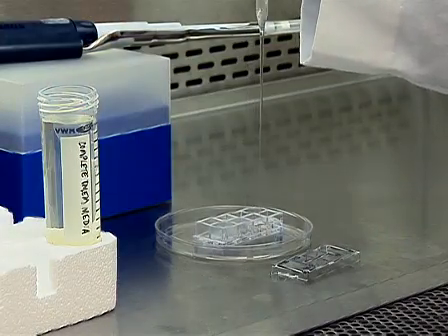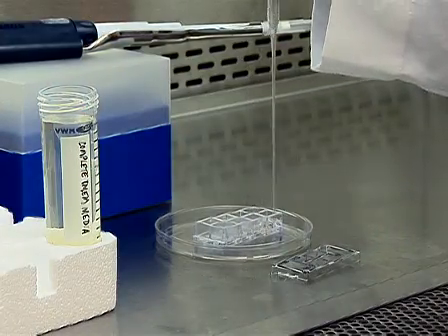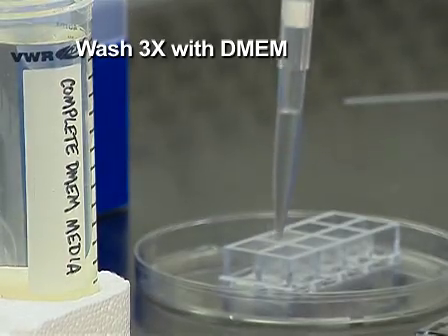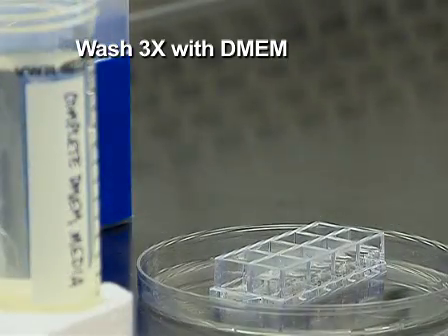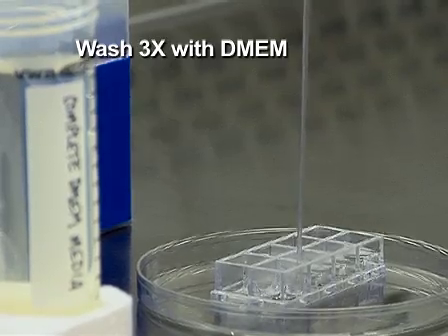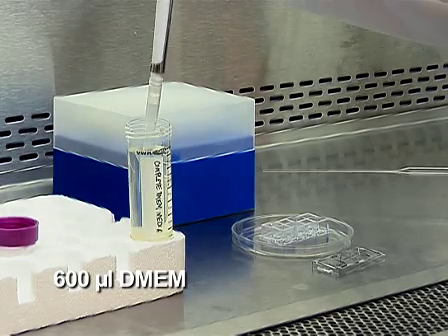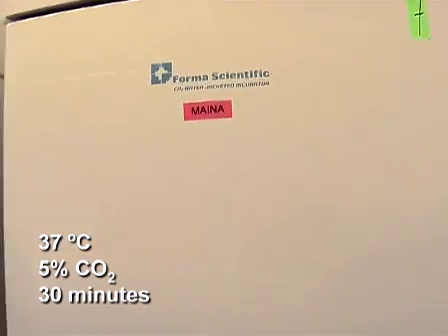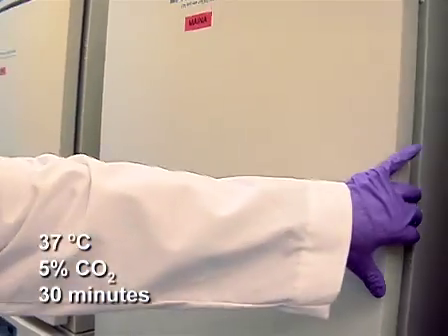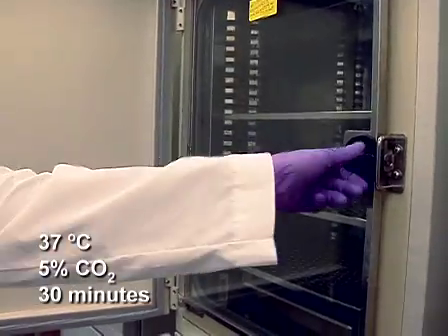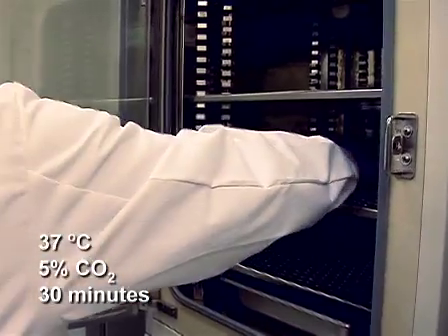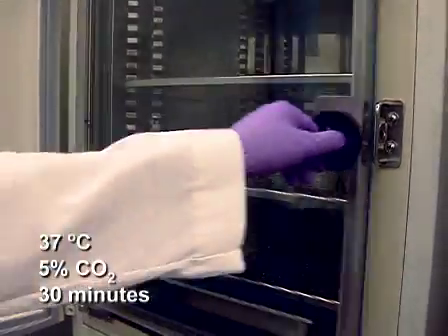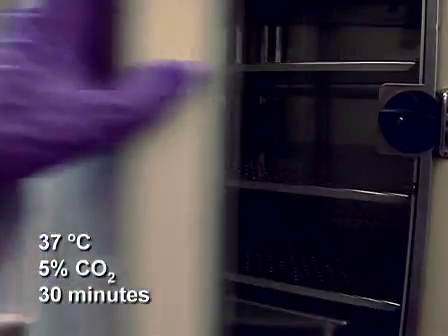After 5 minutes, remove the dilute Hoechst solution from each sample and wash the samples 3 times with 600 microliters of complete DMEM. After the final wash, add 600 microliters of complete DMEM to each sample. Incubate the samples at 37 degrees Celsius, 5% carbon dioxide, for an additional 30 minutes, to allow unincorporated fluorophore to diffuse out of the cells, which is required for intracellular labeling.